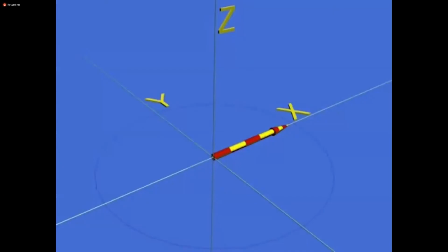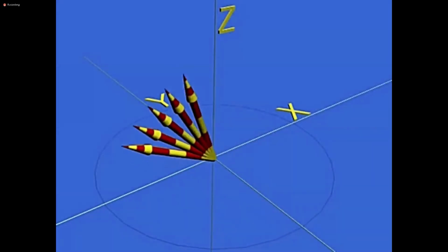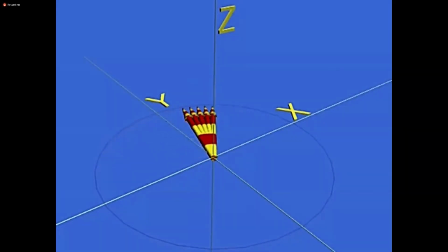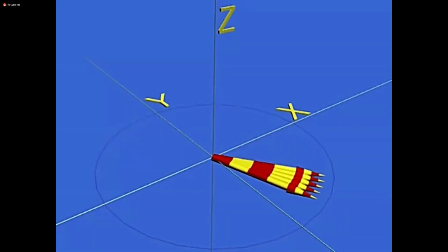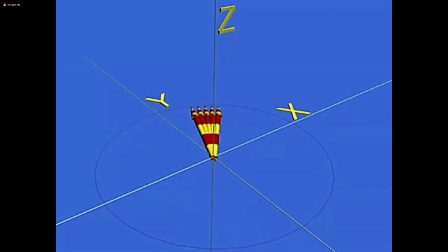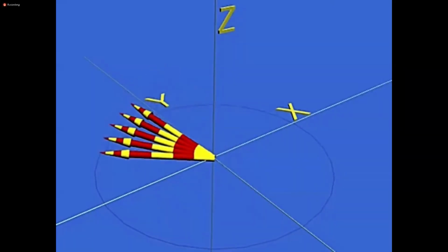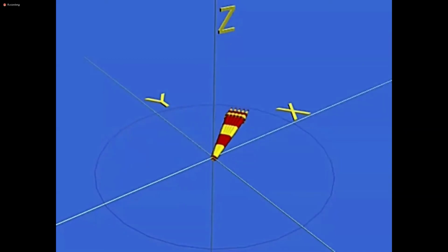Let me show you again here the relaxation. So this is flipped. This is how the echo is generated. Let us look at it again. We have the dephased spins, okay? They were flipped 180 degrees. So we have phase coherence to increase the signal so that we have the echo generated.